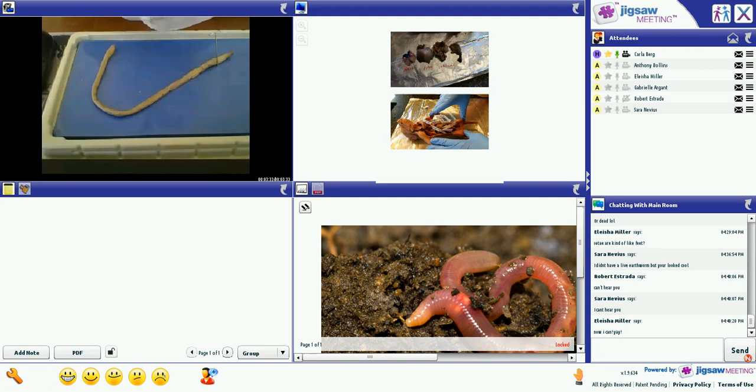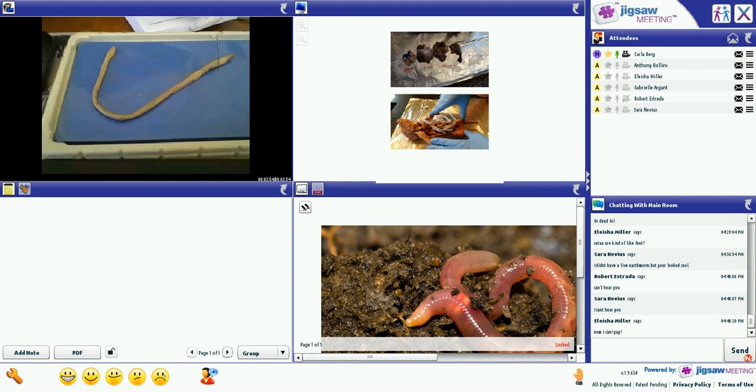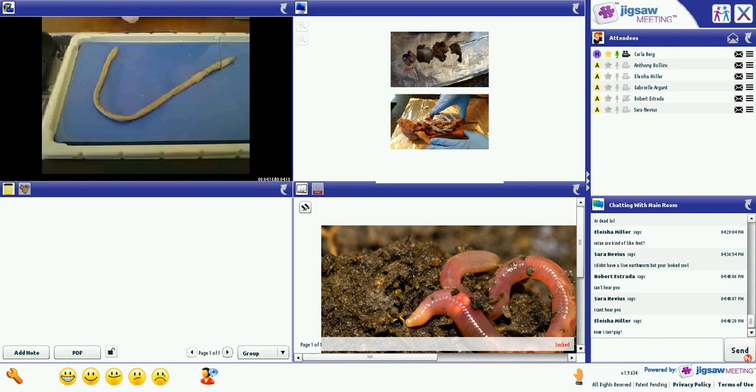The first tool you will use is your scalpel. If your scalpel does not have a blade like mine, you are going to need to put the blade on the scalpel. Yours probably has a blade on it already. Okay, it just locks in place if you need to put a new blade on. So now I have a blade.